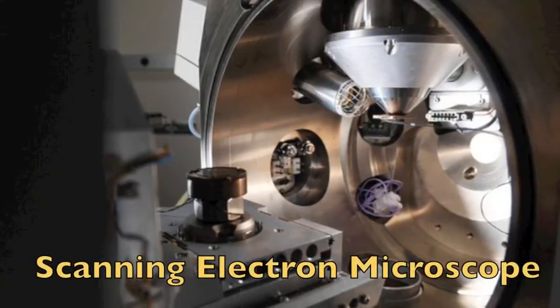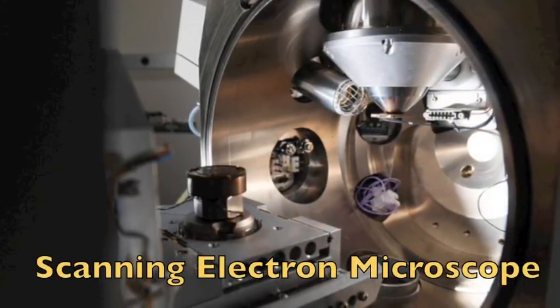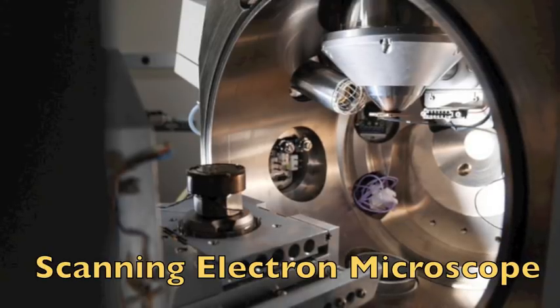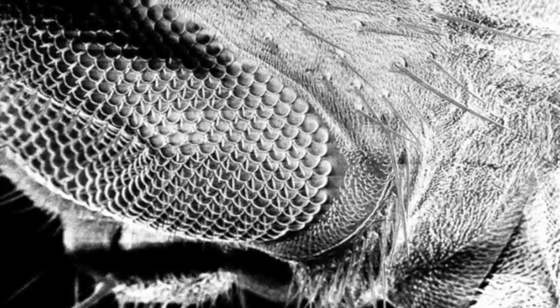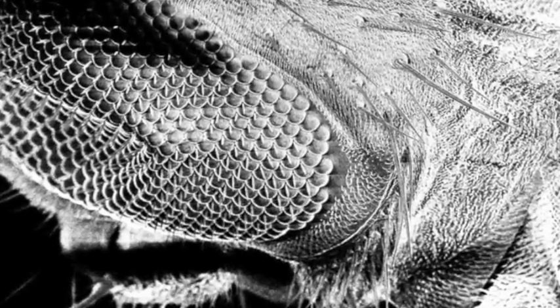This is a scanning electron microscope, which gives a 3D image of the surface of an object by bouncing electrons off of it. These images are really cool to look at.